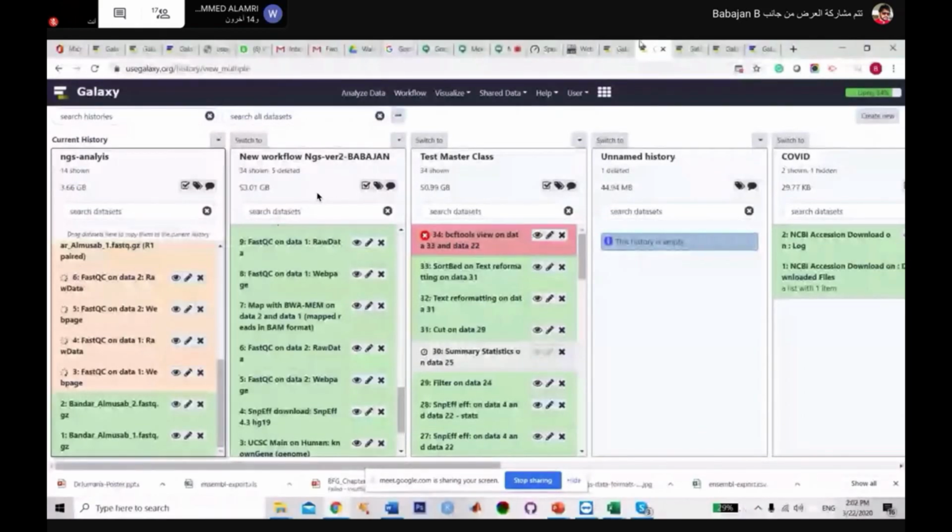I didn't check the sequences I sent to you, whether the quality is good or not. You can check that. If the quality fails, if it's not good at the end of the reads, then you can use a trimmomatic method. Once you use the trimmomatic method, again you have to check the quality of the reads. Once it is passed, then use the same trimmed FASTQ reads for the further analysis, the alignment with the reference, using BWA.